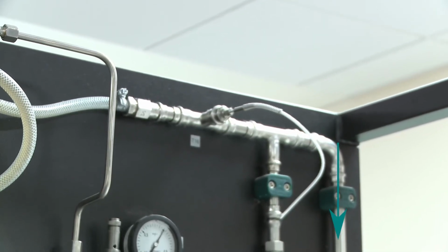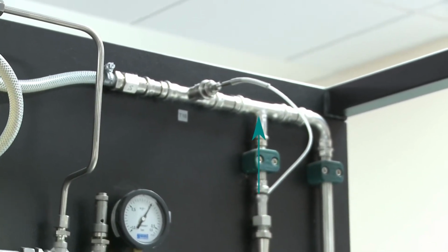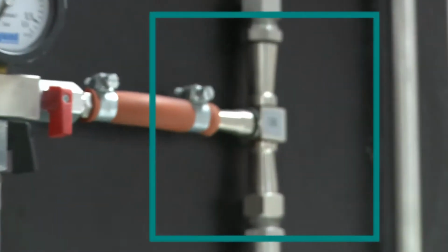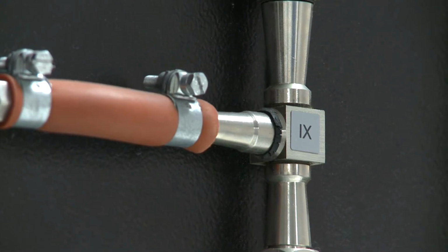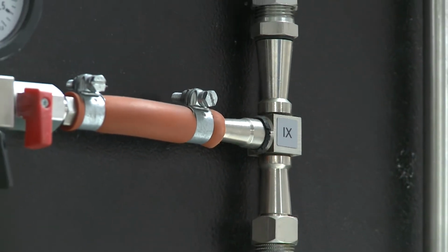But the pipe that's joining it in the middle is also some waste water, and it's coming from a piece of equipment called a water jet vacuum pump. So that's this kind of device that you see now in the middle of the screen that we'll zoom in. And what a water jet vacuum pump does is water sprays up from the bottom through the water jet, and that sucks air in from the left-hand side using the Venturi effect.